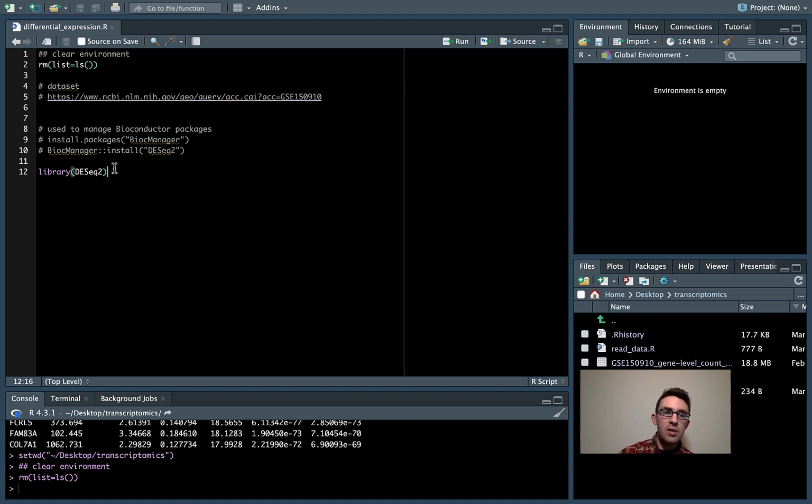And we're going to be using this package here called DESeq2. I think this is probably the most popular R package for doing differential expression analysis. It's at least the one I've seen used the most. So yeah, that's going to be the topic of today's video. Okay, so let's get started.